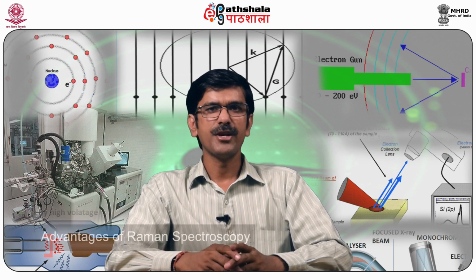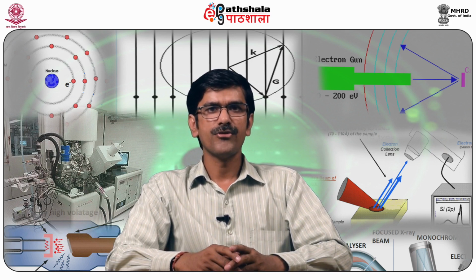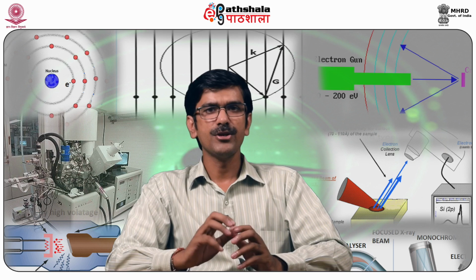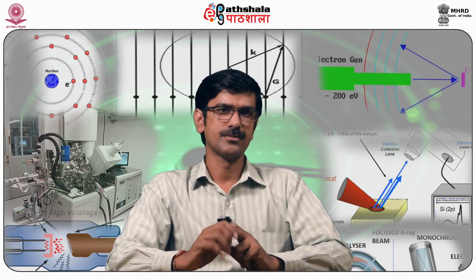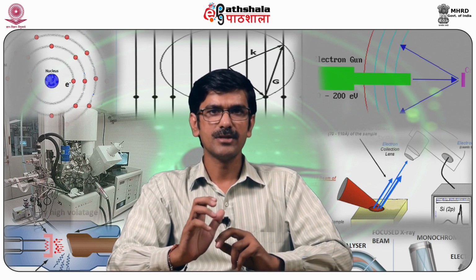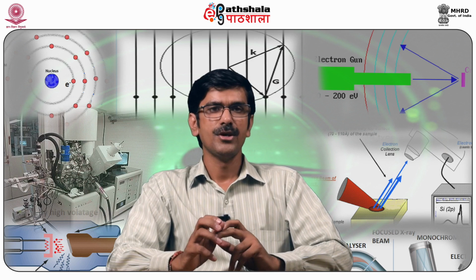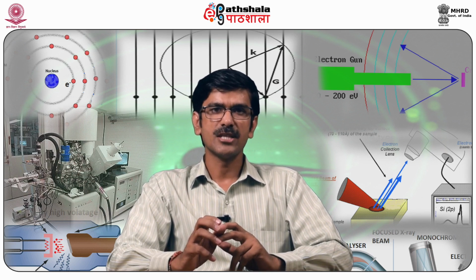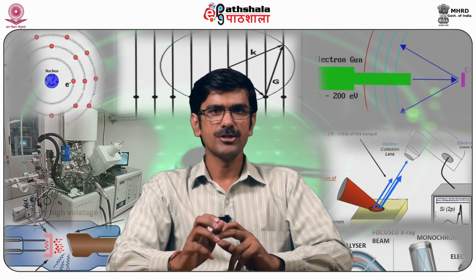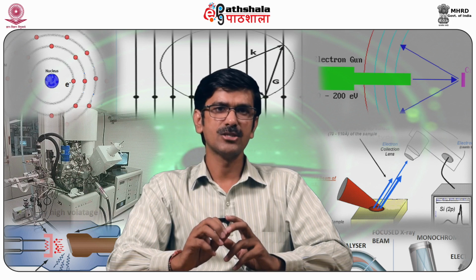Now, the advantages of Raman spectroscopy. It provides molecular fingerprints of each analyte. It provides the possibility of highly selective determinations. It is applicable to any optically accessible sample, that is, it could be organic, inorganic or biological. Solid, liquid, gases, transparent and non-transparent samples can be measured. Aqueous solutions present no special technical problems, and sample scanning is non-invasive.